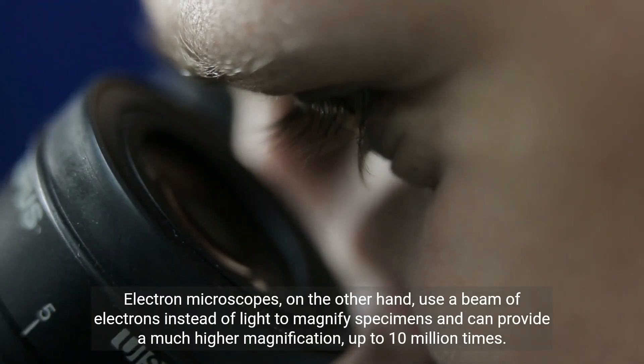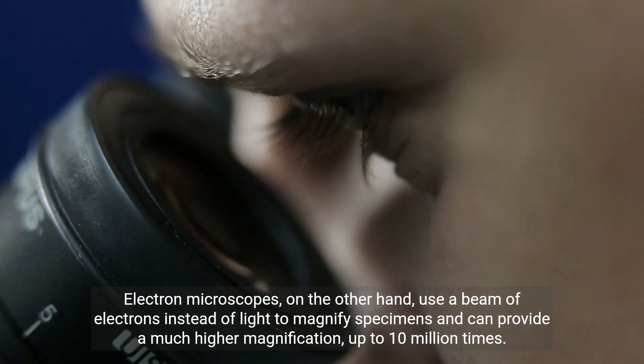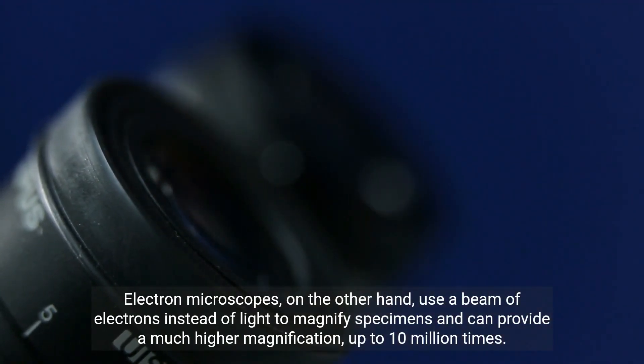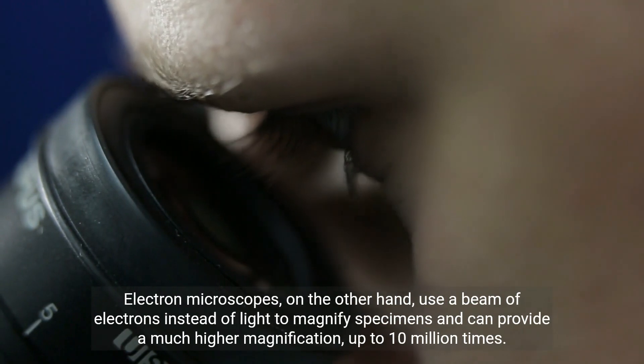Electron microscopes, on the other hand, use a beam of electrons instead of light to magnify specimens and can provide a much higher magnification, up to 10 million times.